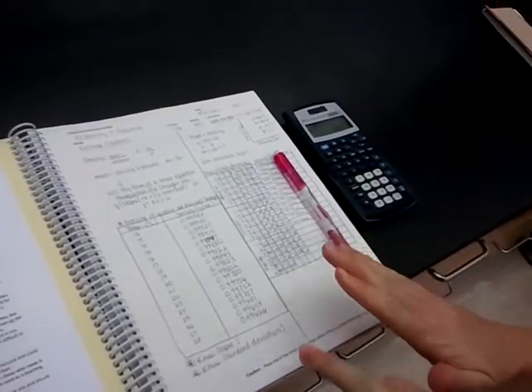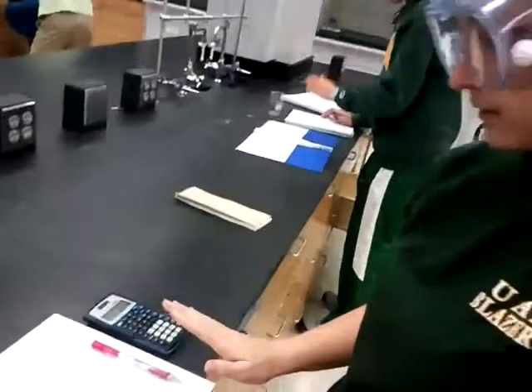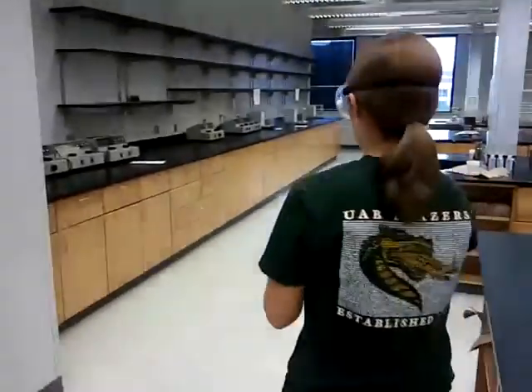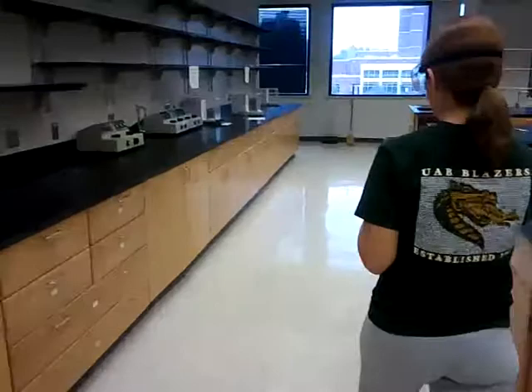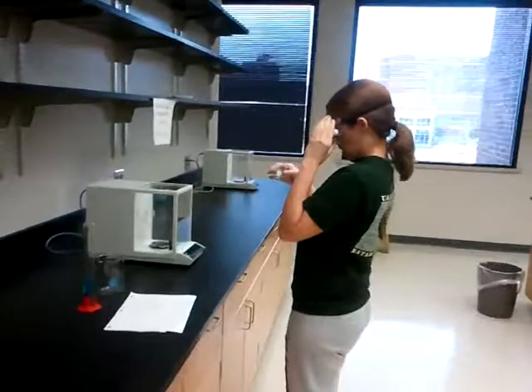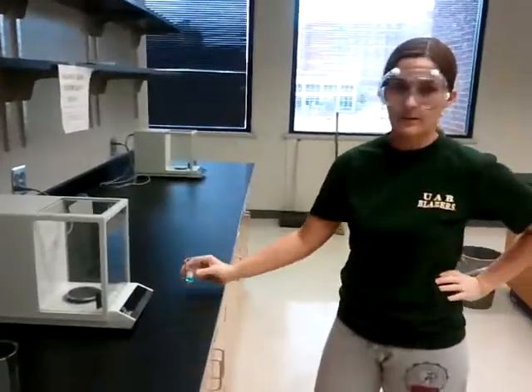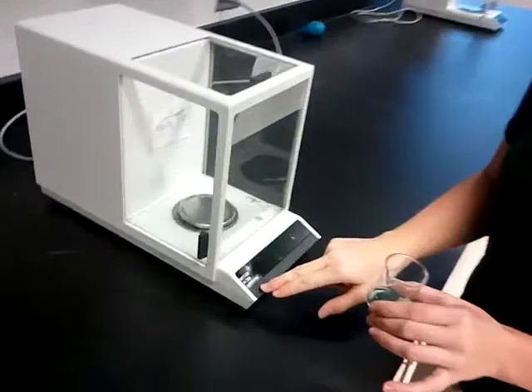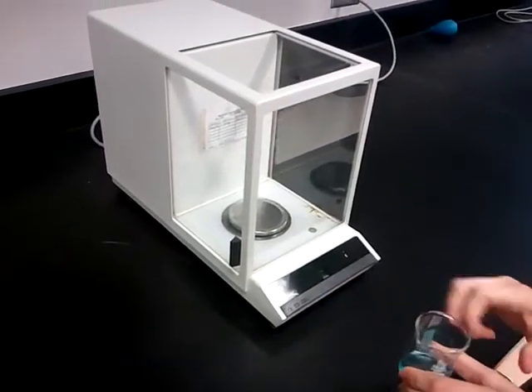Now, after we get our volumes measured and write it in our lab manual, we're ready to weigh it. You want to come over to the analytical balance, make sure that you turn it on, and then zero it out.